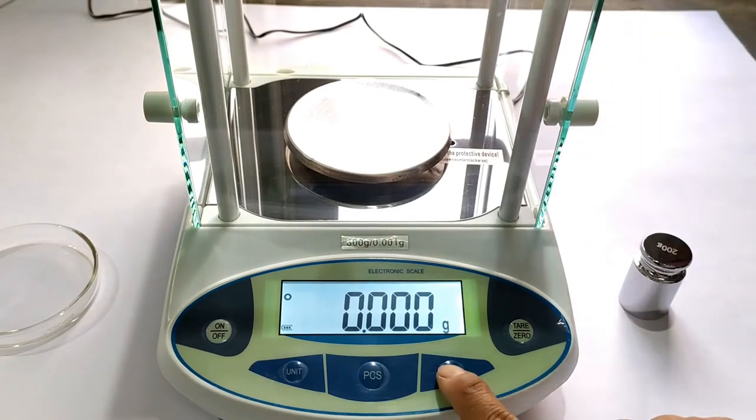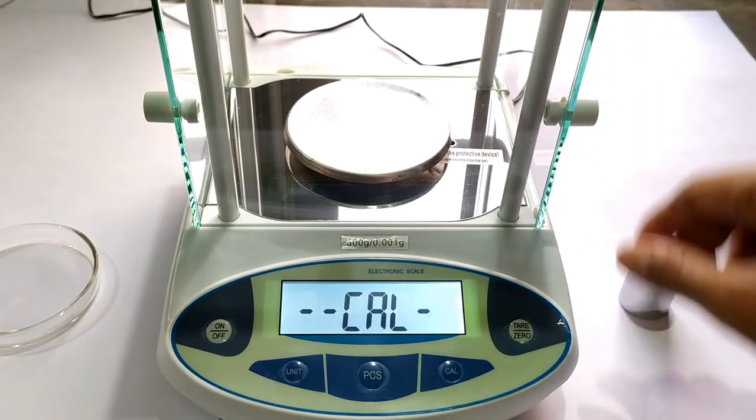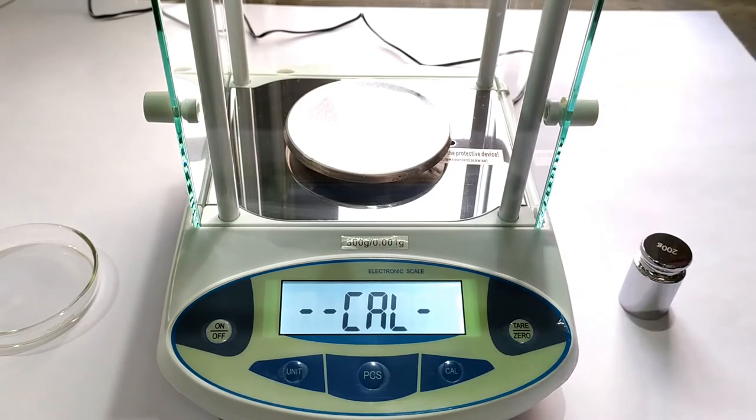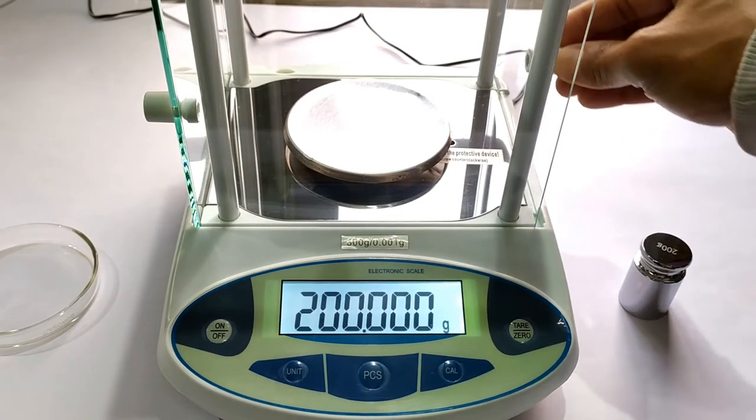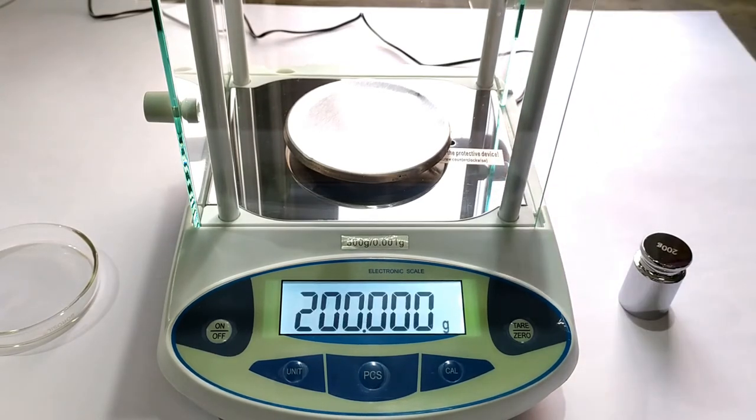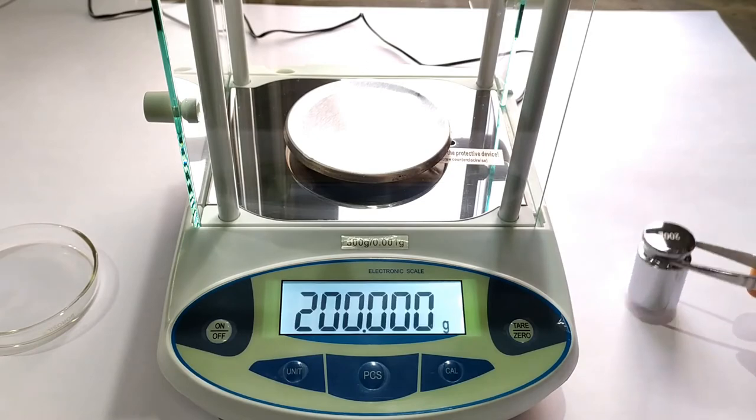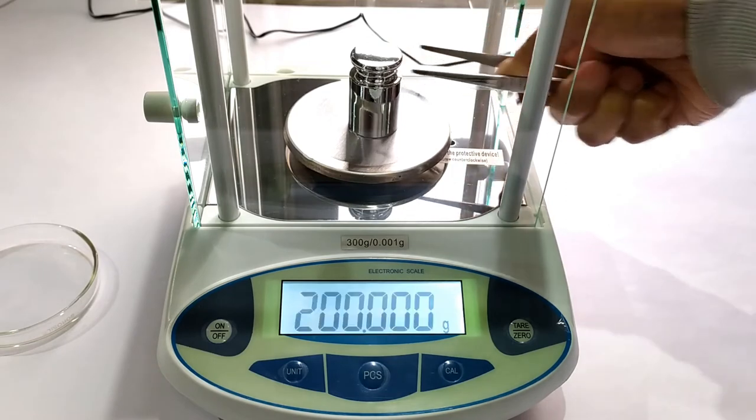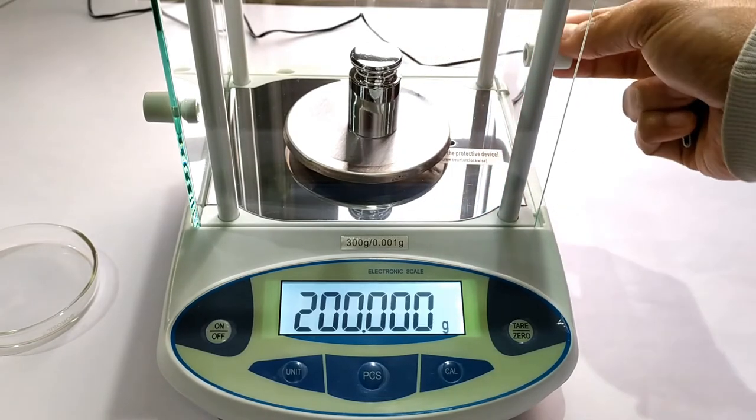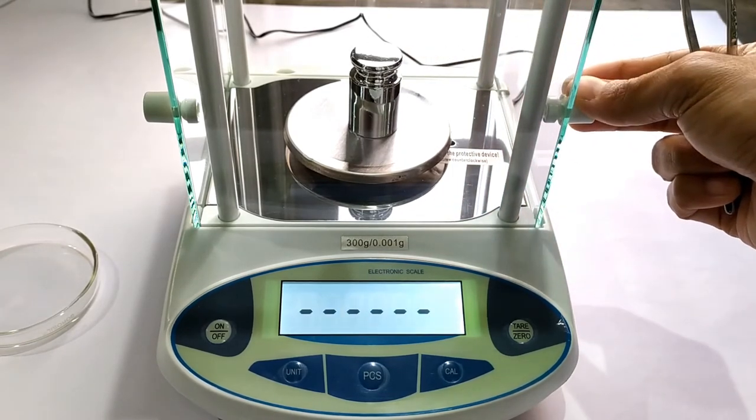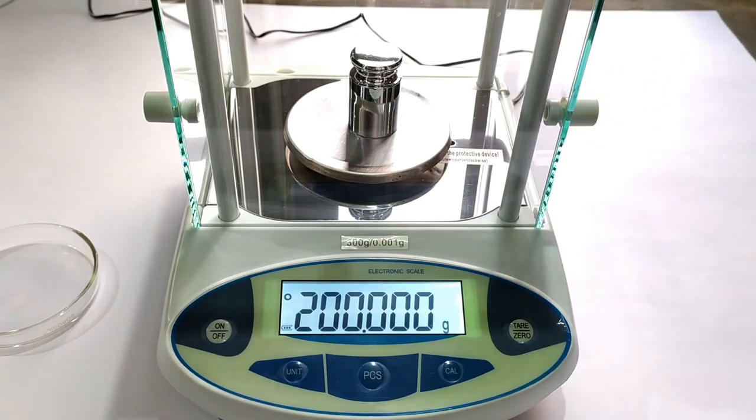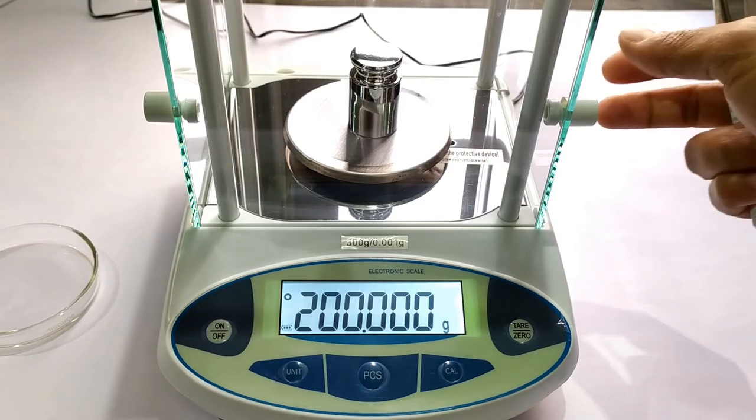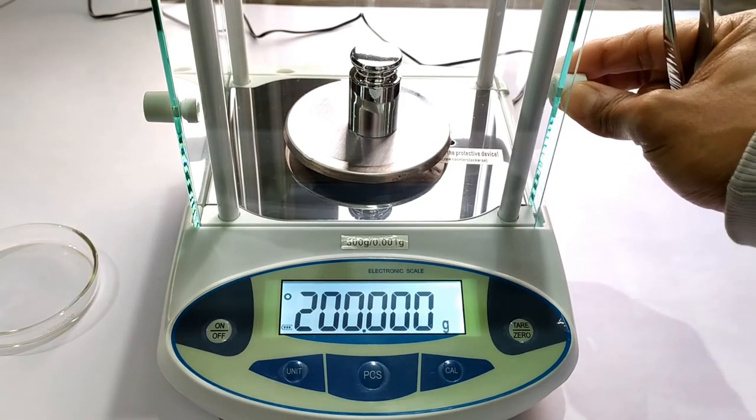And when 200g blinks on the screen, we place the 200g standard calibration weight onto the weighing pan. The screen eventually stops blinking and if it remains at 200g that means the device has been calibrated. We now remove the weight.